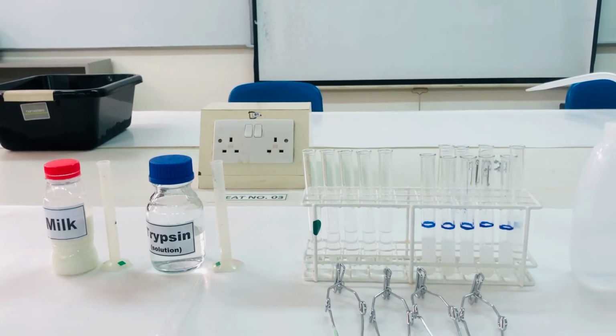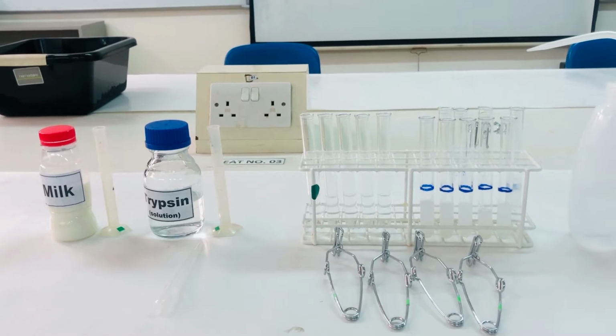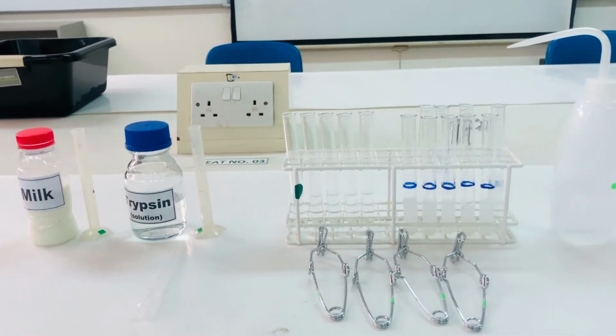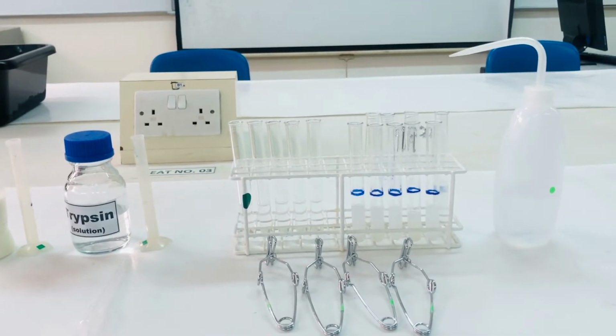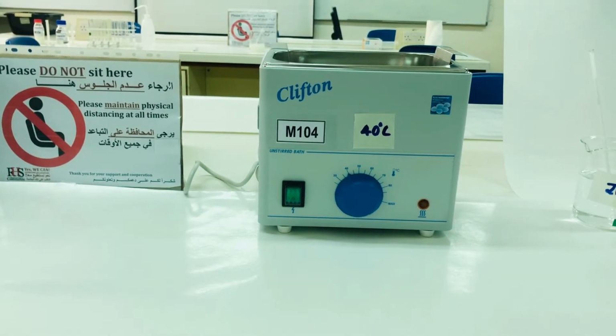Along with these two things, we will be needing test tubes, test tube holder, graduated cylinder, dropper, wash bottles, etc. In order to see the effect of temperature on enzyme activity, water baths at different temperatures have been maintained.